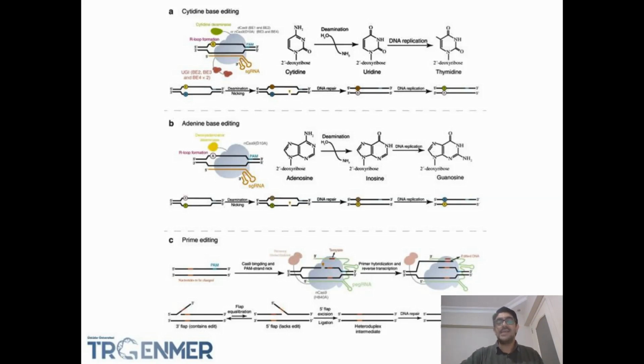And the next question is: not only changing a single nucleotide polymorphism or editing mutagenesis, what about inserting sequences or deleting sequences at that target? These kinds of applications were not applicable for the base editor. That's why in 2019, the prime editing system was developed.